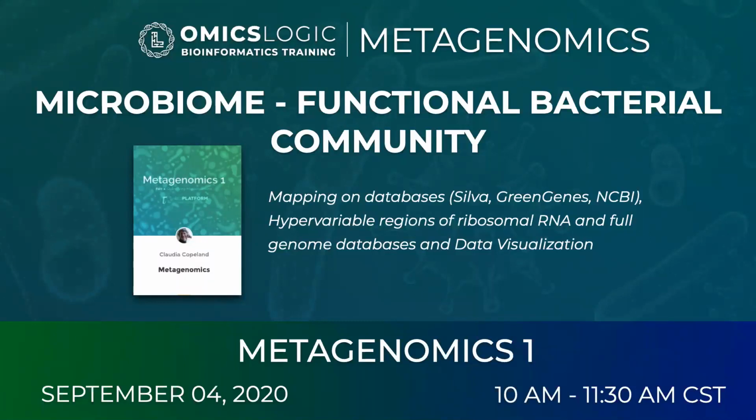So then we will talk about how the microbiome actually functions. How do we understand the functional impact of a community? There are different strategies. Using different databases, we can understand taxonomic composition, but also we can talk about the impact or association with a particular condition. So we'll talk about that on September 4th.